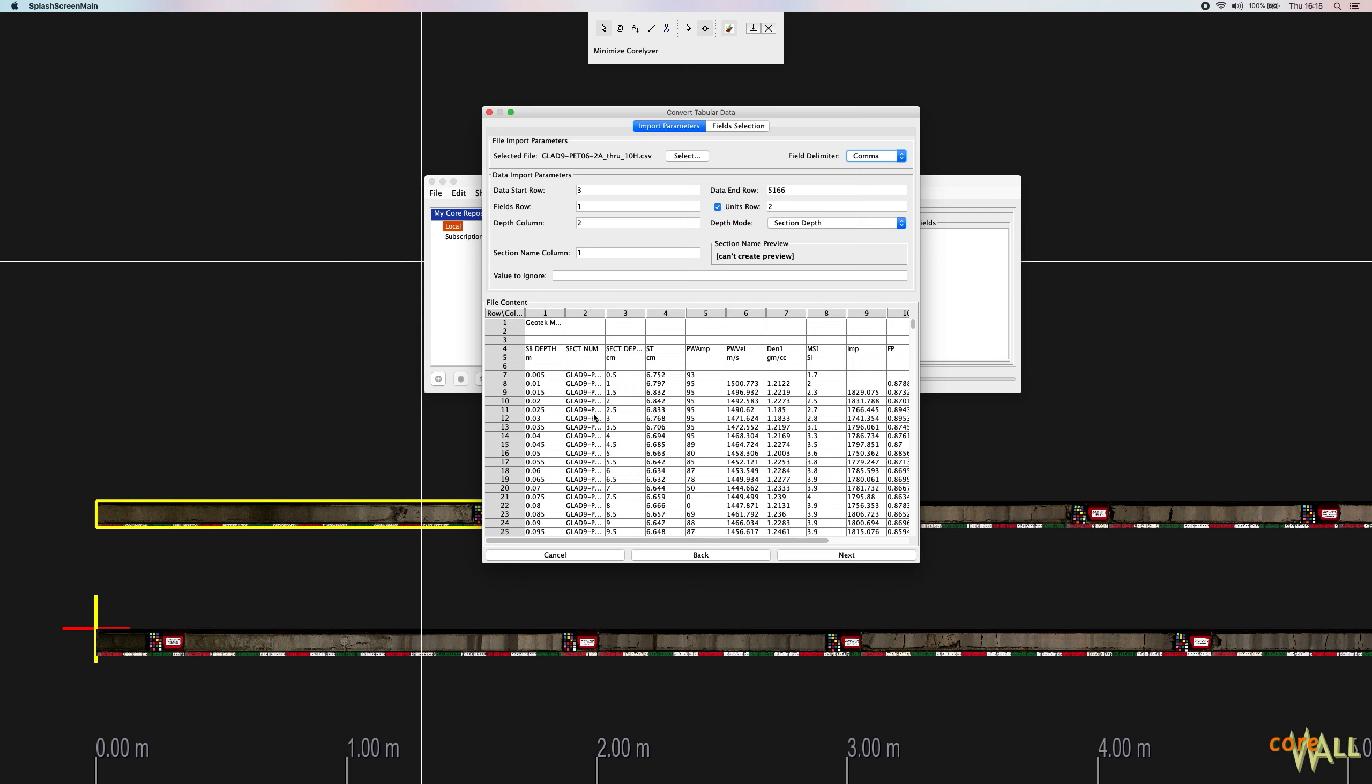So make sure that looks correct before you proceed. Once the columns of the table look correct, you'll enter row and column numbers in the data import parameters area to import your data completely and correctly.